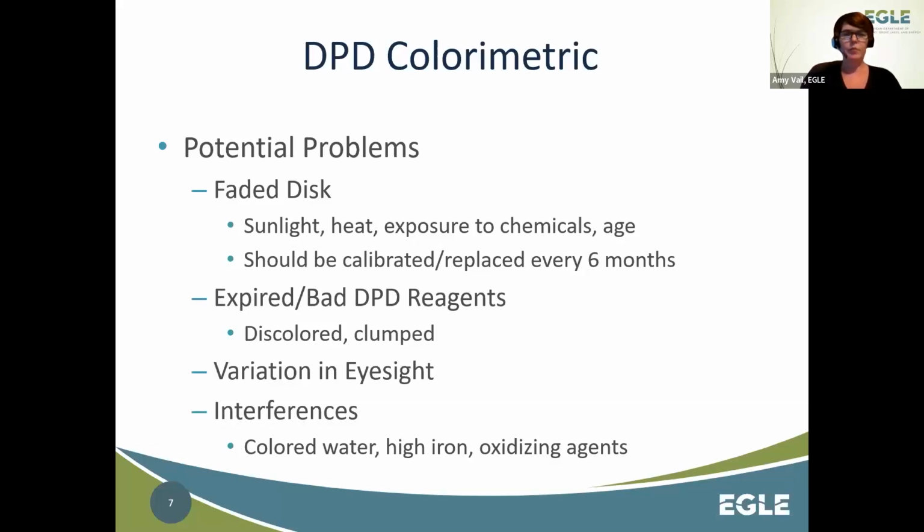You could have expired or bad DPD reagents. So if the DPD reagents are discolored or clumped, you should get rid of those, or expired, you should get rid of those because that will affect how much of a reaction that you have.